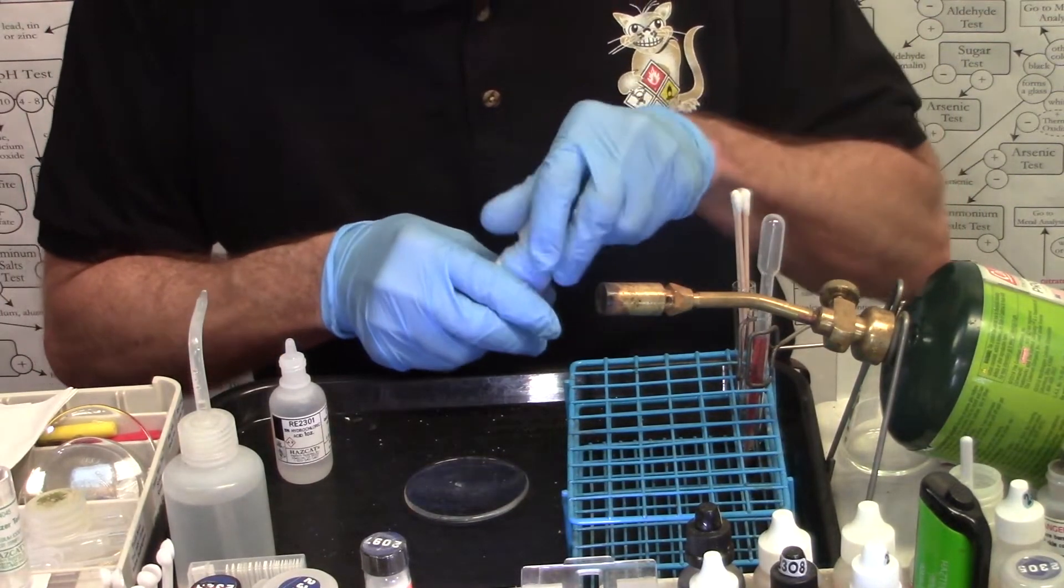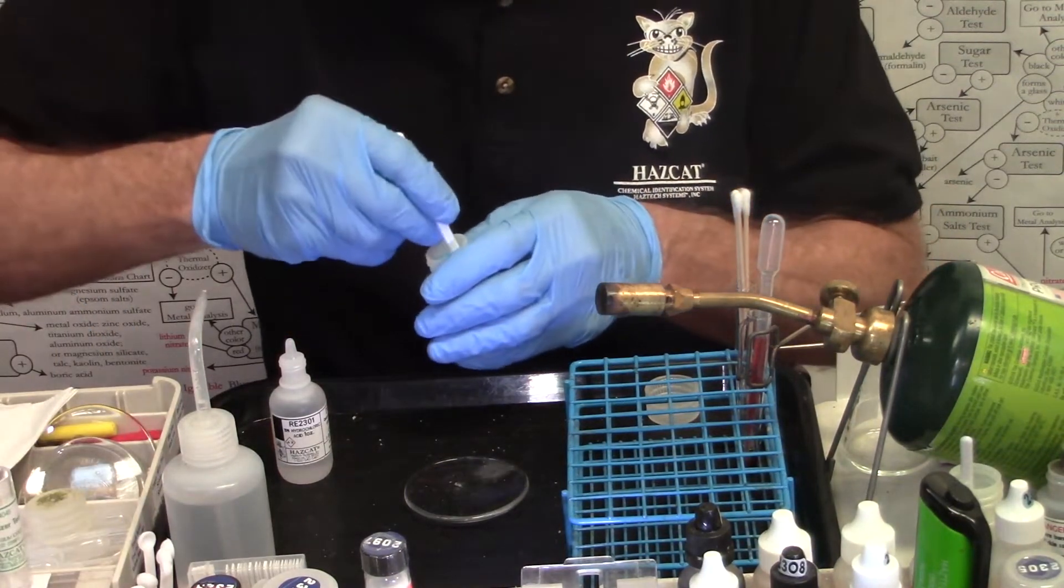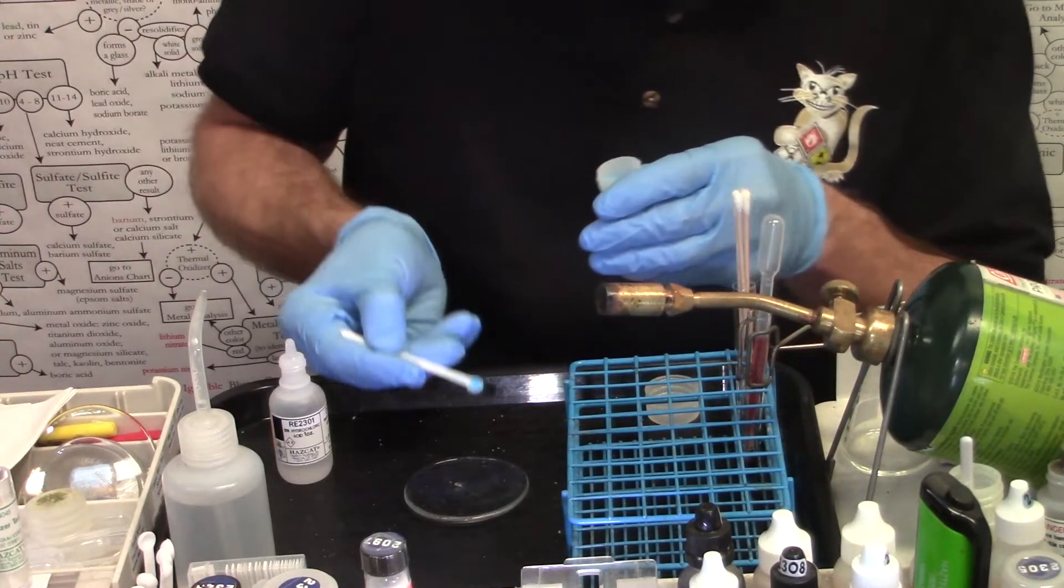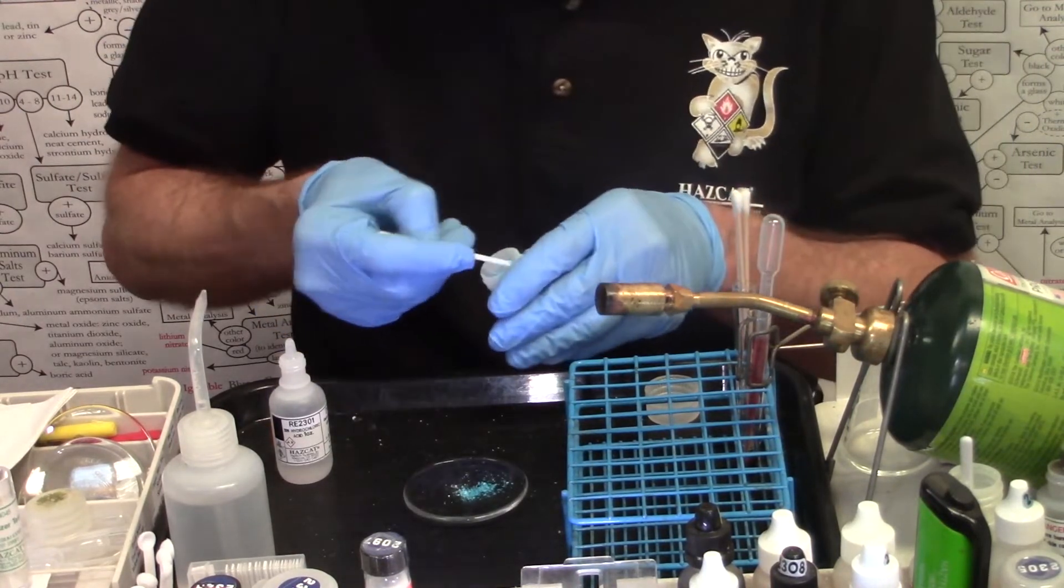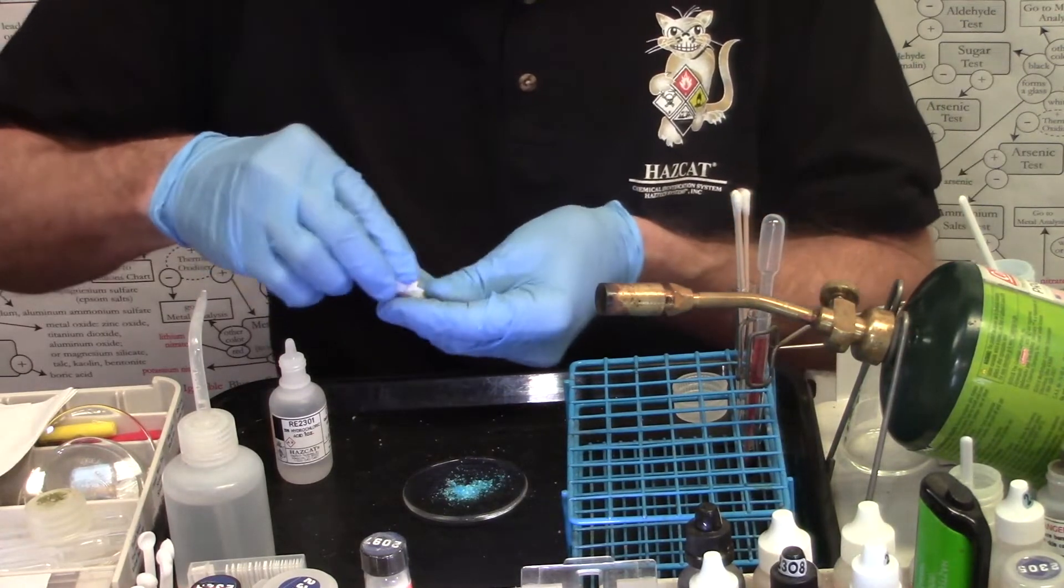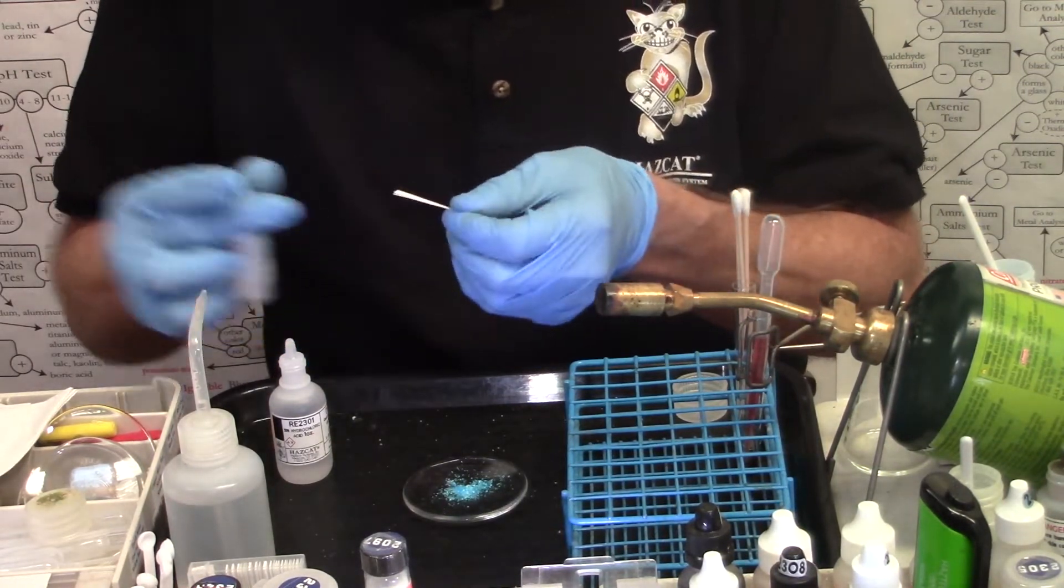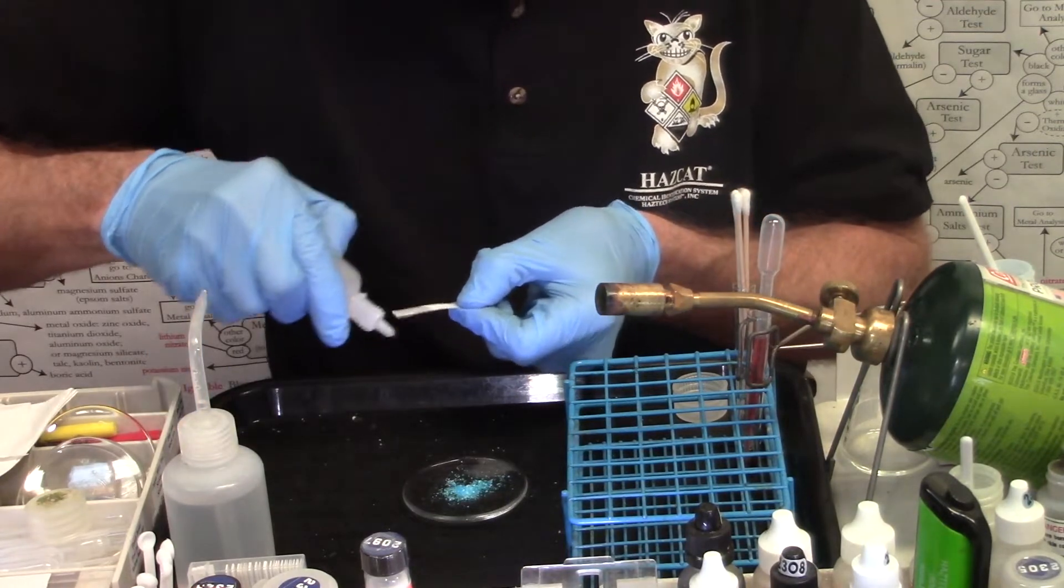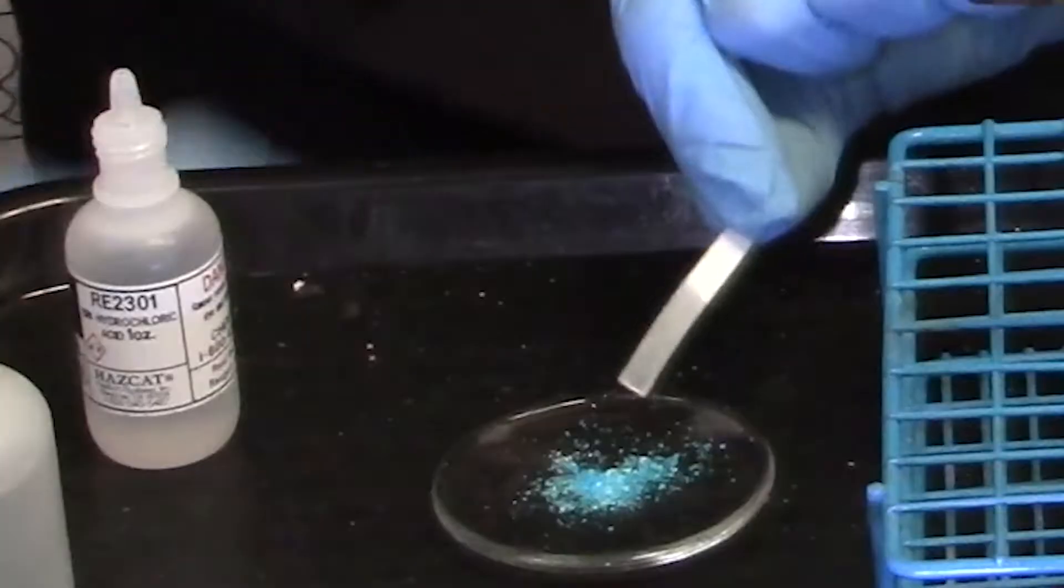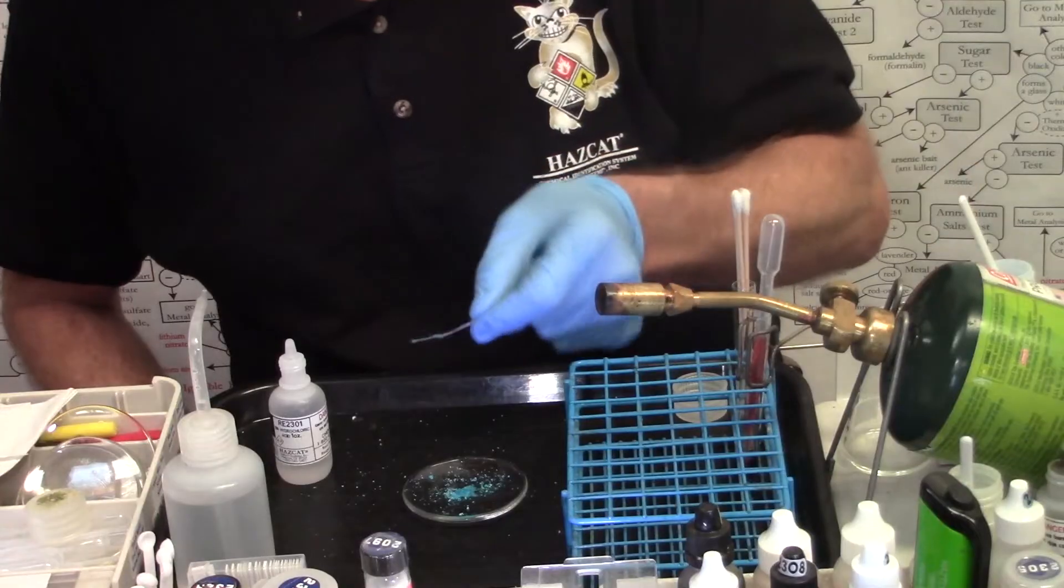Here I have a blue solid. Take two spoonfuls of my blue solid. One, two. Two drops of hydrochloric acid on my oxidizer test strip. One, two. And then it's one one thousand, two one thousand, three one thousand. Lift, look.